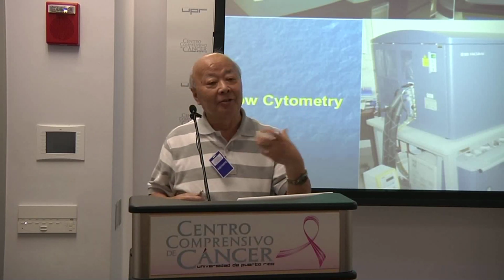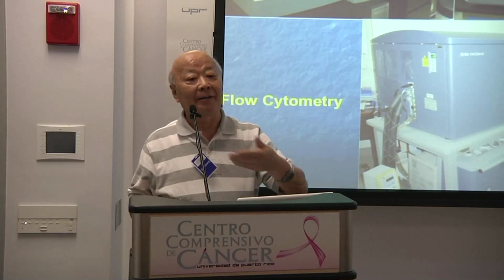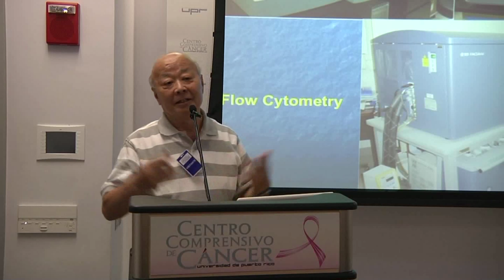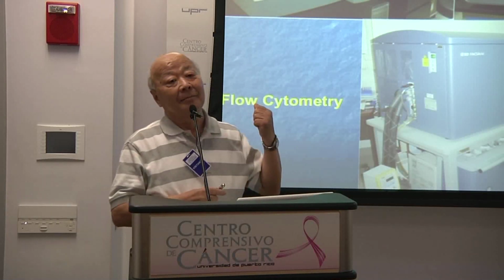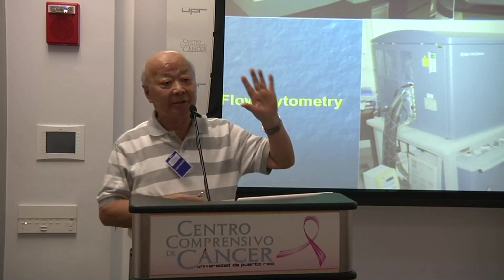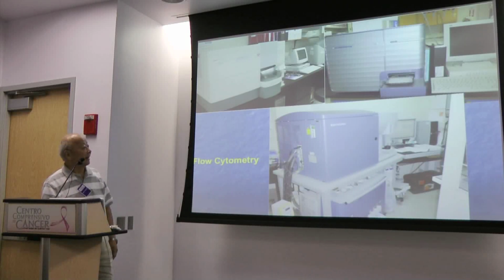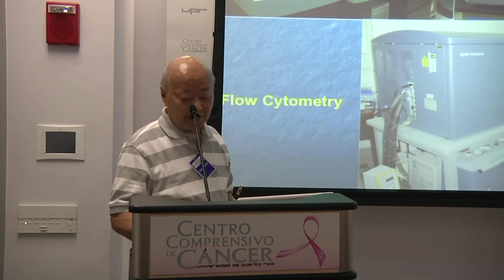So you can look at some protein component, for example, cytokine or chemokine in the plasma during diseases. Or we can look at the messenger RNA expression in the cells. And this is the FACSAria 11-color cell sorter.